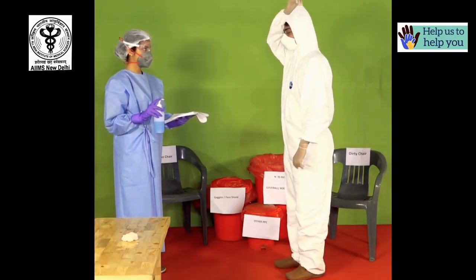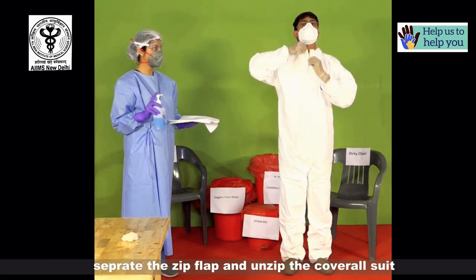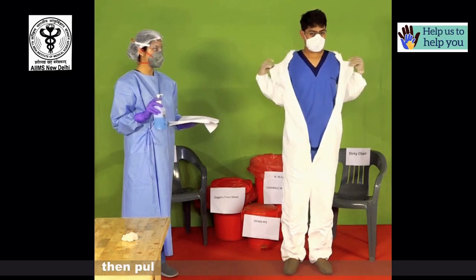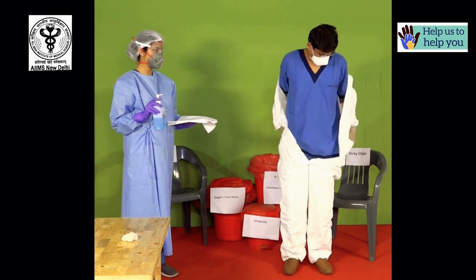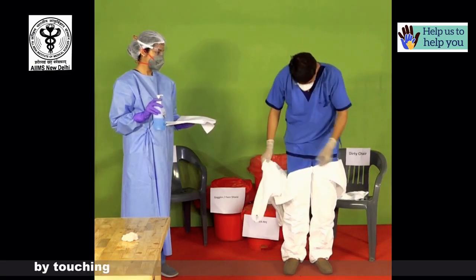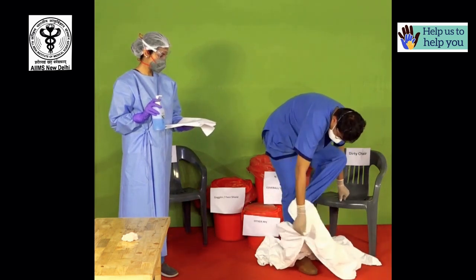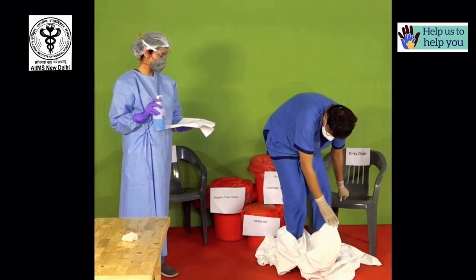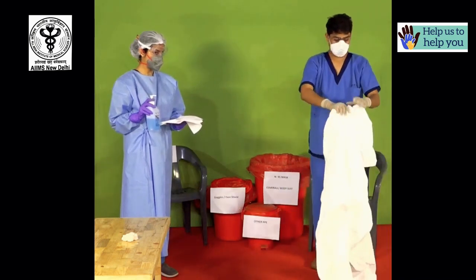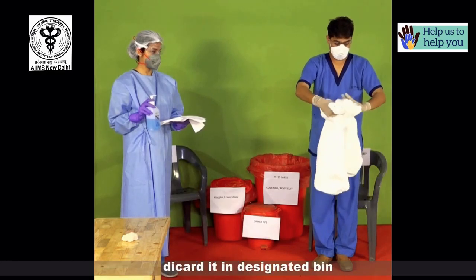First, slide back the hood by holding it from the top. Separate the zip flap and unzip the coverall suit. Holding the suit at the arms, slide it off the shoulders slightly. Then pull the suit from the side of the waist and roll your arms out. By touching only the inner surface of the suit, carefully roll out each leg. Discard it in the designated bin.